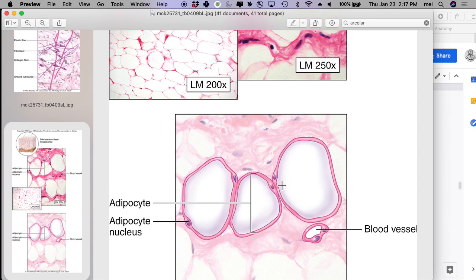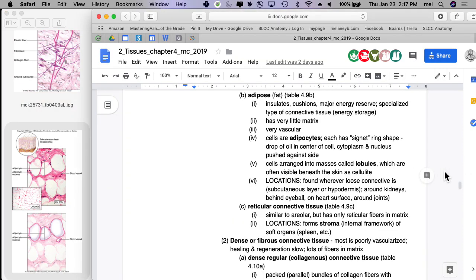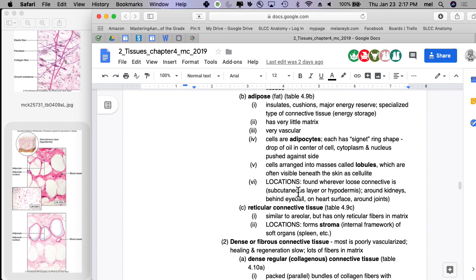And let's just learn a little bit more about adipose and then I'll let you guys go. So, if we were given the slide, we'd label it adipose. Loose connective, just adipose, and if I asked you which category it fit into, loose or dense, you would tell me loose. But it's just actually called adipose tissue. So do you kind of understand how adipose got to look like it did? Okay, so what is adipose's job?